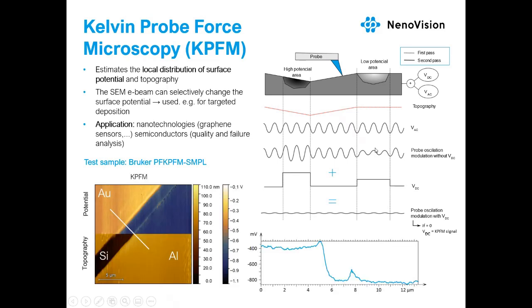One application is in-situ detection of selectively changed surface potential by the electron beam, used for targeted deposition in nanotechnologies or the semiconductor field. Shown here is a test sample of gold, silicon, and aluminum from Bruker, and a potential graph along the white line visible in the image.